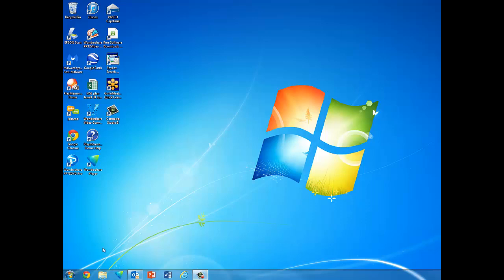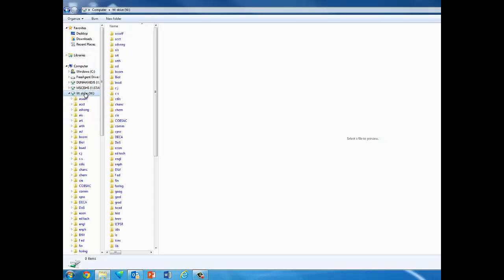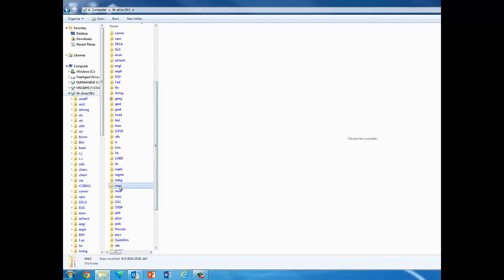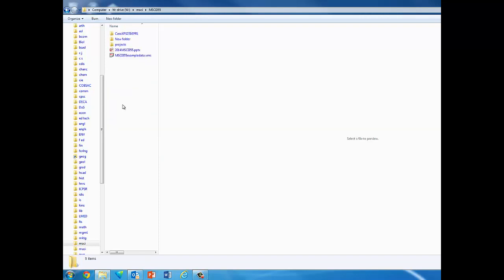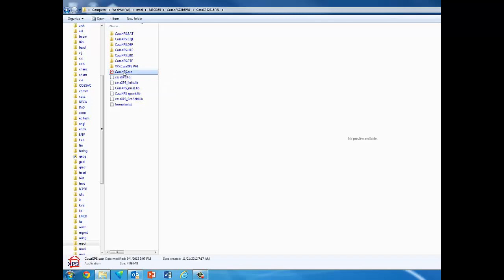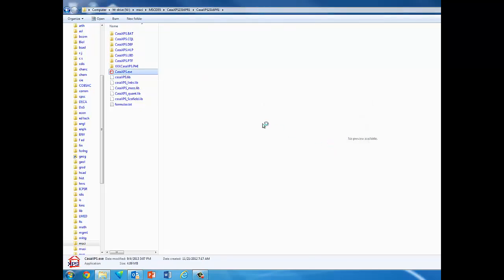The program to perform peak identification and peak fitting can be found on the W drive, in the MSCI 355 folder, and then in the CASA XPS folder. The program is called CASAXPS.exe, so we double-click on that and run it.